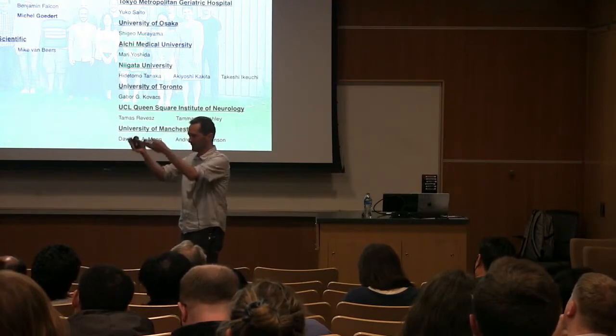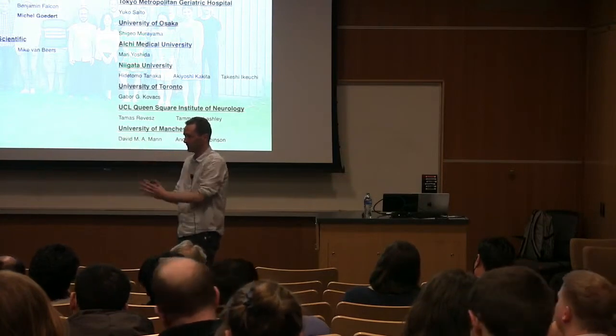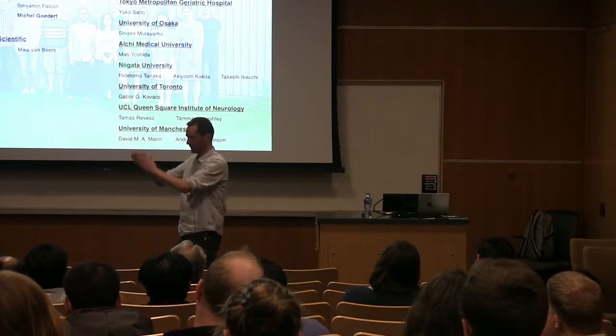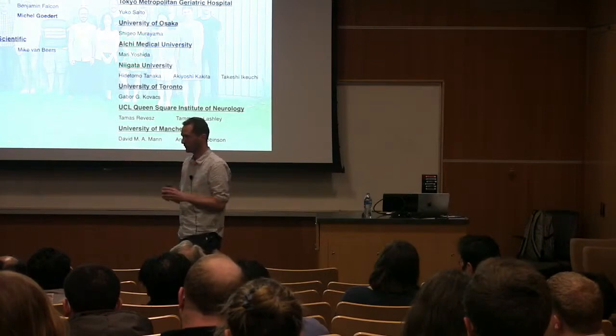And so the interactions between them, you're right, some of them seem very weak. You know, PHF is just backbone interactions, possibly a bit of hydrophobic interactions. They're quite tightly packed again. The distance between them is very small because there are some glycines, but why that is so strong that you always see these PHFs, because we don't see any single protofilaments in tau in Alzheimer's brain, for example.